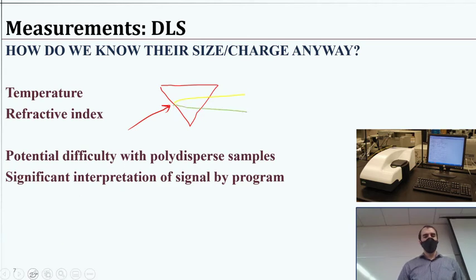But just as an illustration here, you hopefully get the picture. When you do that, the material here has a refractive index that is unique to each wavelength, and so the refractive index is essentially a measurement of how much slower the light is passing through that material.